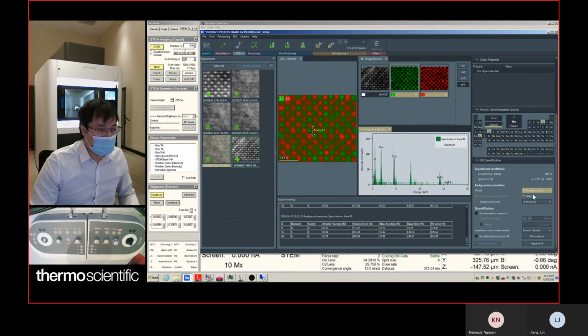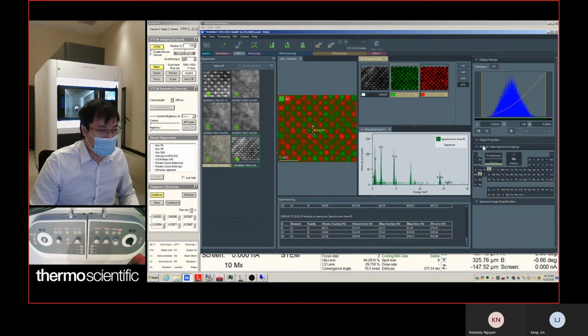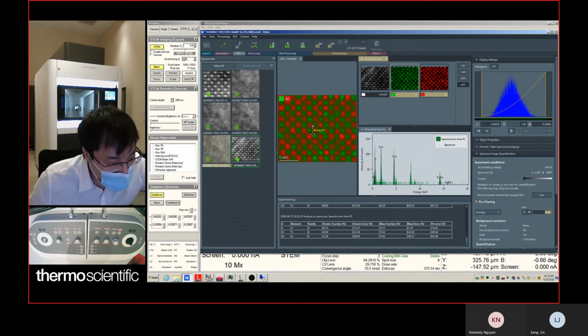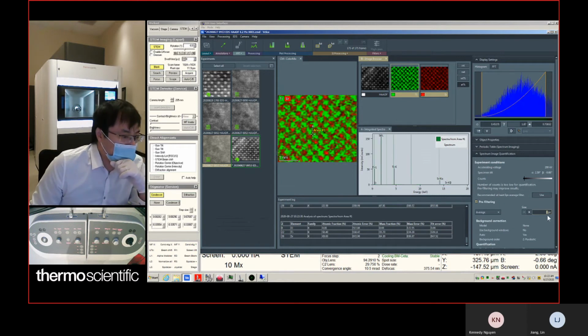But if you do, let me better explain. Do quantification. If you do just 1 pixel, results stay the same.